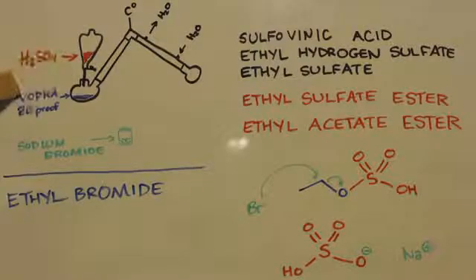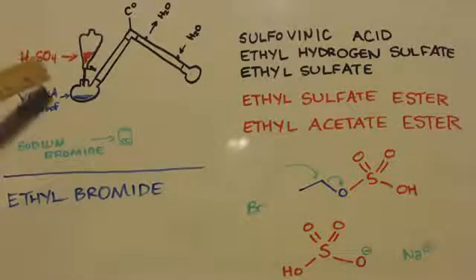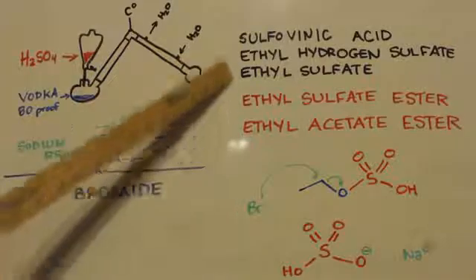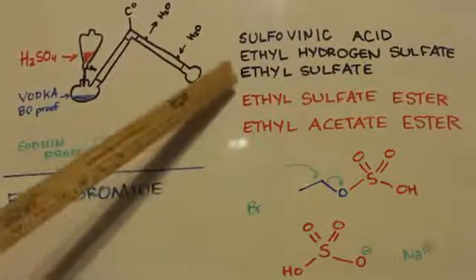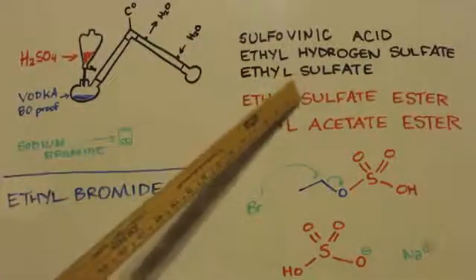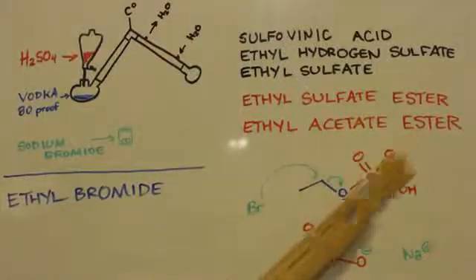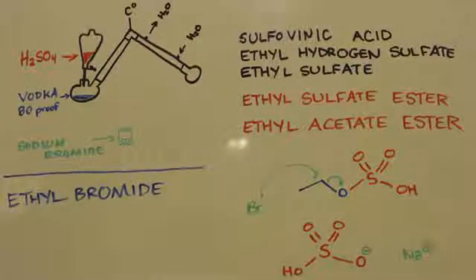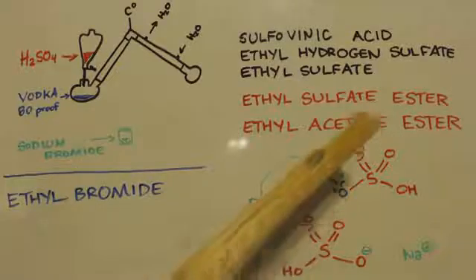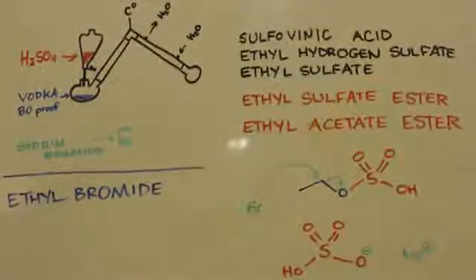Down in the pot, I'm going to have vodka, 80 proof, and I'm just going to drip it in to make this stuff here. It goes by many names, but basically it's the ethyl sulfate ester. And just like an ethyl acetate ester is the ester using a carboxylic acid, you're just using a mineral acid. That's the only difference.